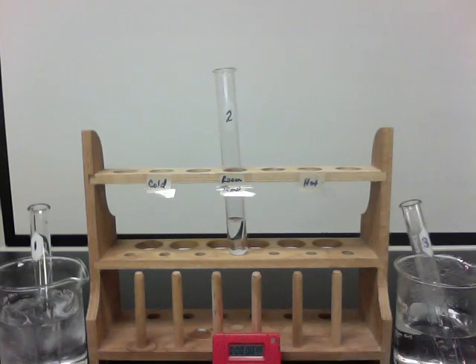In this lab, we are looking at the effect of solution temperature on reaction speed.